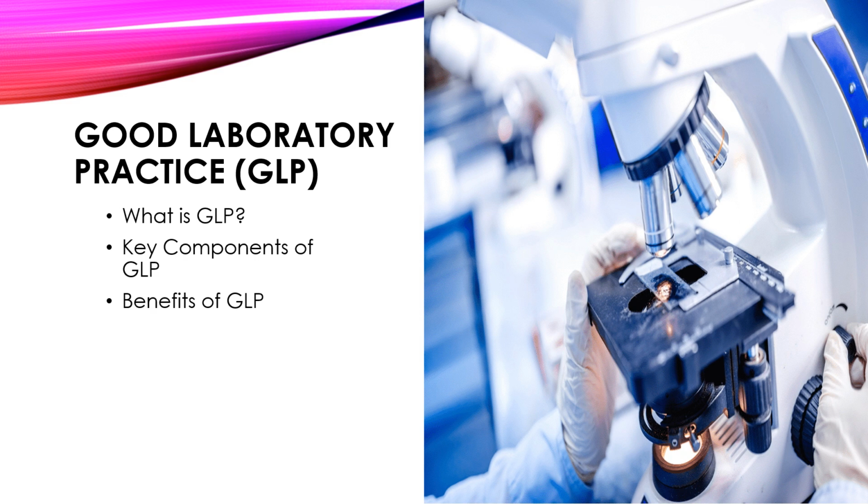The second benefit is regulatory compliance. Many regulatory authorities require good laboratory practice compliance for the submission of non-clinical safety data supporting product registrations or approvals. Meeting good laboratory practice standards facilitates regulatory acceptance of study findings and expedites the approval process.